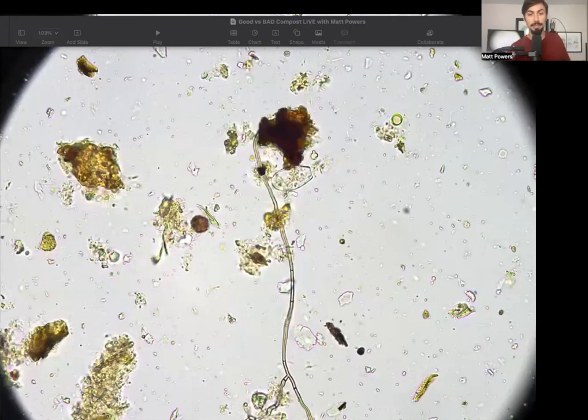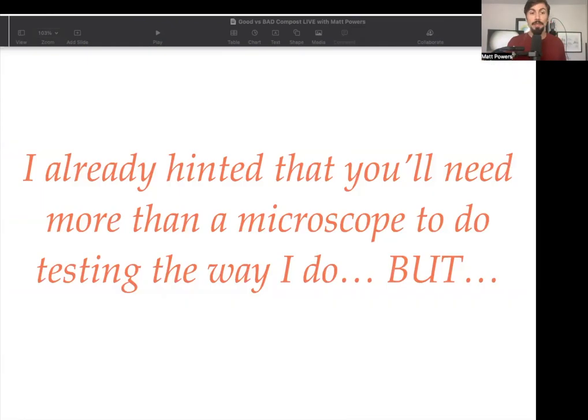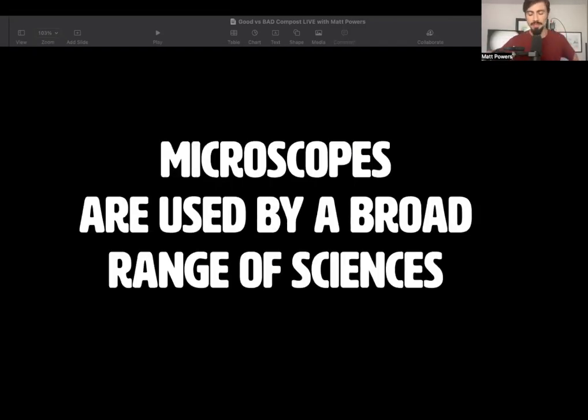The protozoa there — if you were part of the soil biology primer, you know all this stuff now. You can spot things very easily, even when it's chaos. Tons of spores in this catalyst bio amendment — we'll look at this later. I also already hinted that it was high in nitrate. I don't want people to think I promote only a microscope approach, but microscopes cover a broad range of sciences.